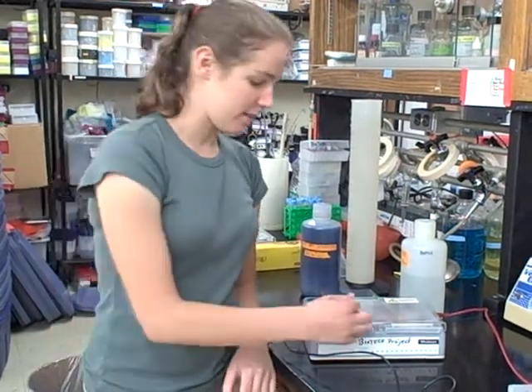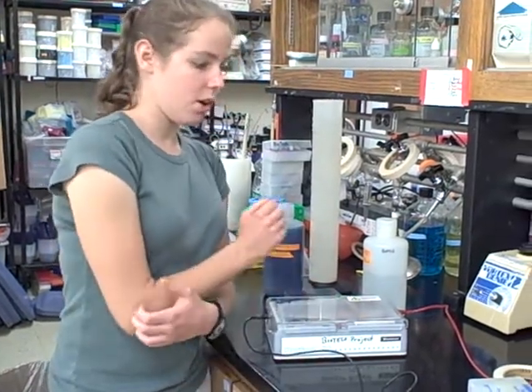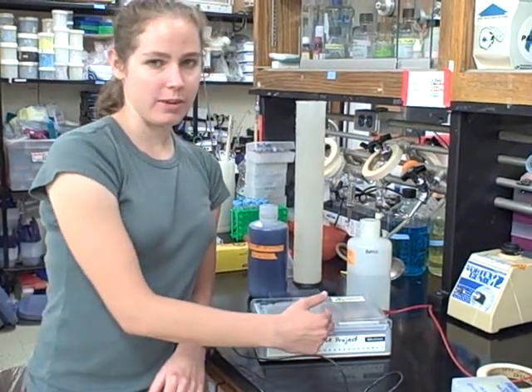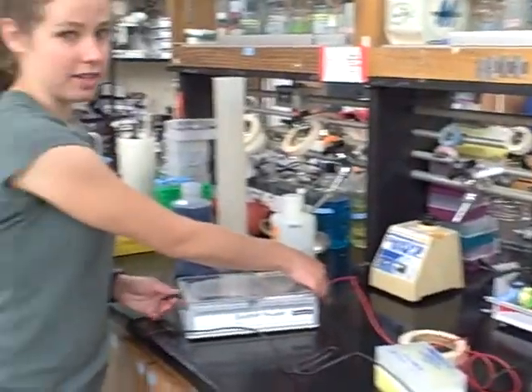Run your gel until the purple dye band is past the second red line on the gel. This should take about 25 or 30 minutes. Once the purple dye has passed the second red band, turn off your power supply and unplug the electrodes.